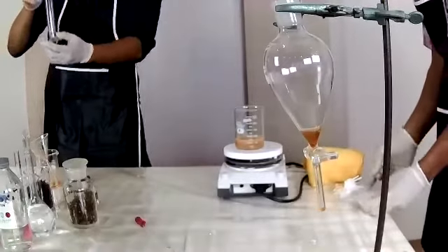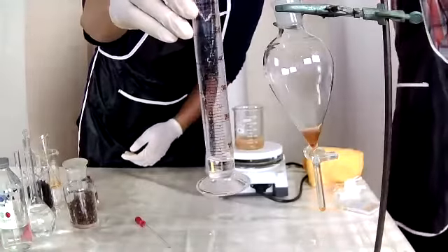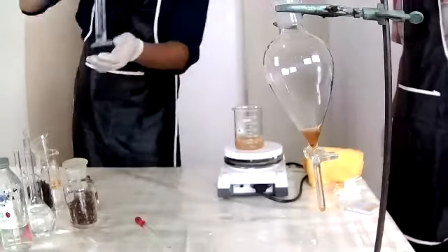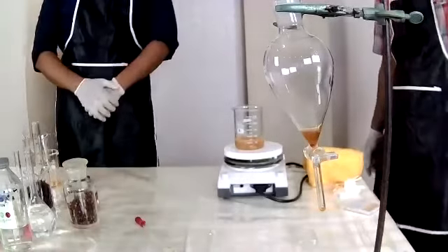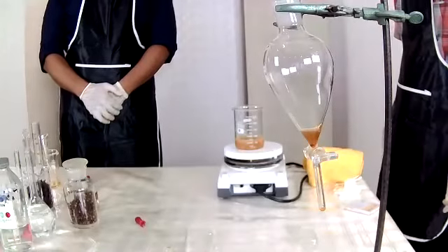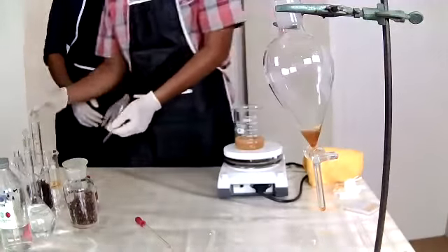So the reaction has reached its balance. So we added 24 milliliters. But you need to check the pH level over time while you're adding the solution here.